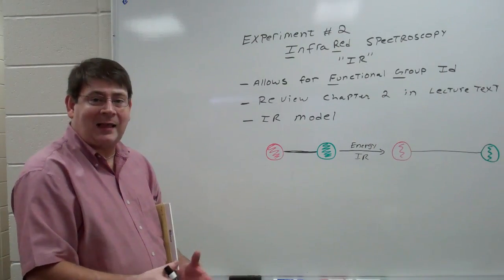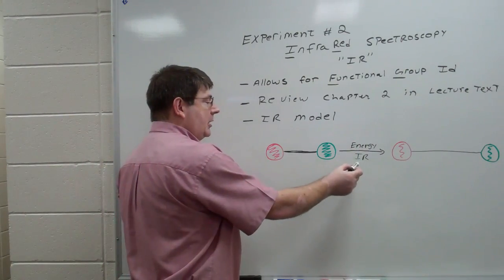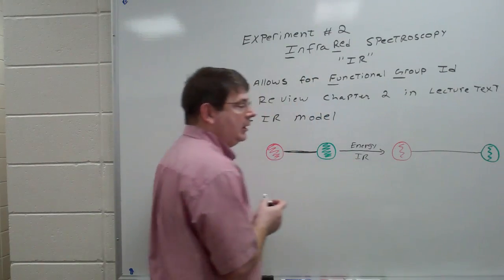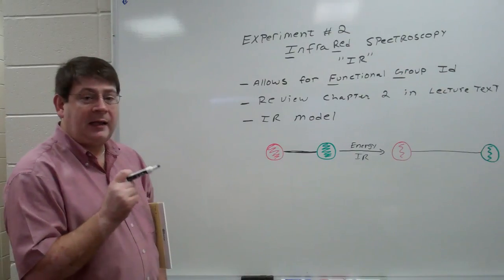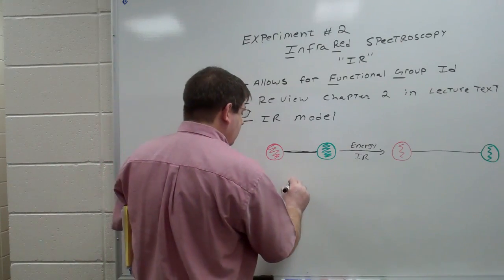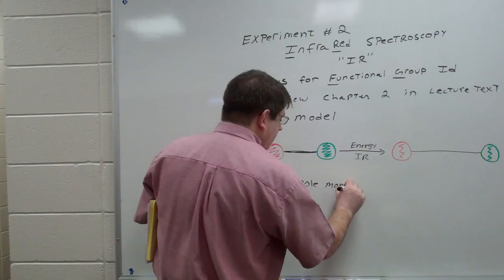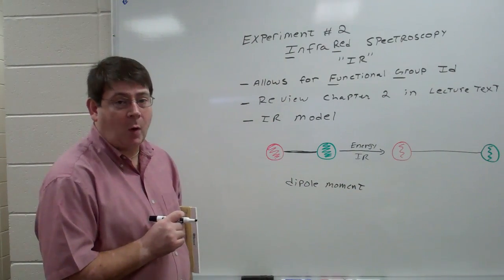Molecules are not static. They vibrate. And it turns out that you can put energy in the form of IR radiation and actually stretch that bond to be longer. And we can detect this using an IR spectrometer if, and only if, this results in a change in dipole moment. Okay, so if we get a change in the dipole moment, we can actually observe this by infrared spectroscopy. So what do I mean by a dipole moment?